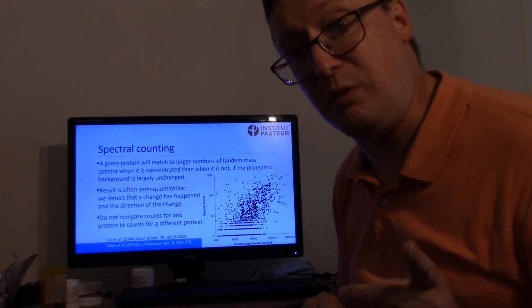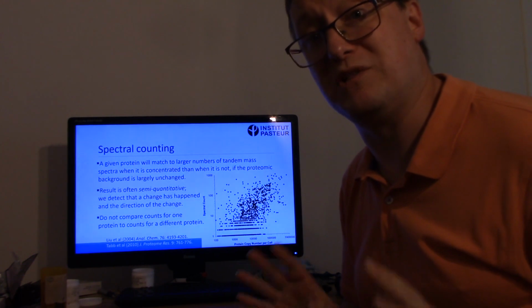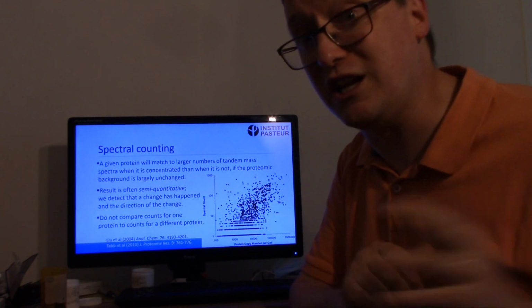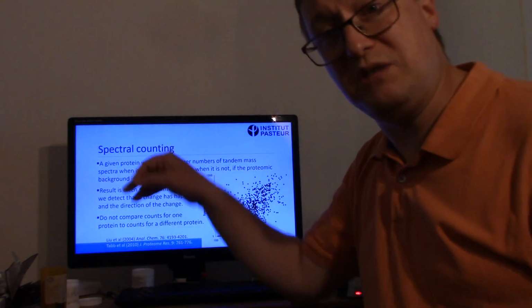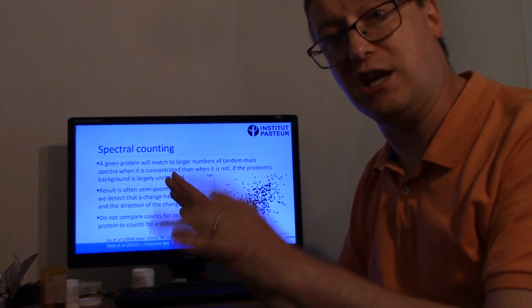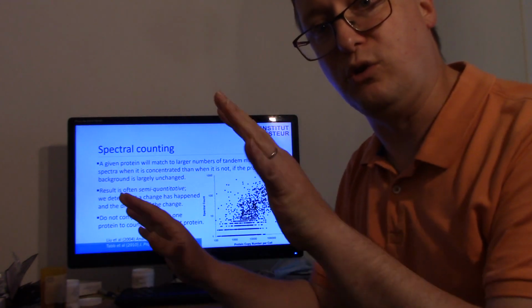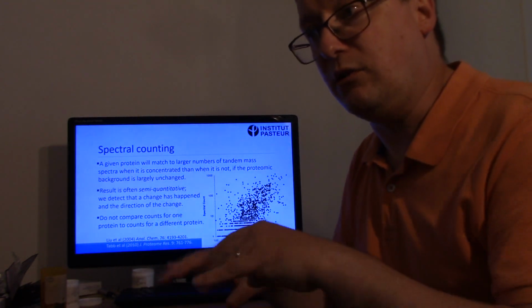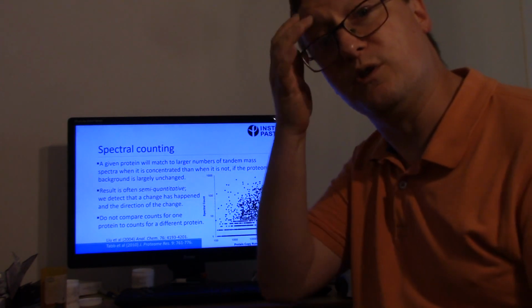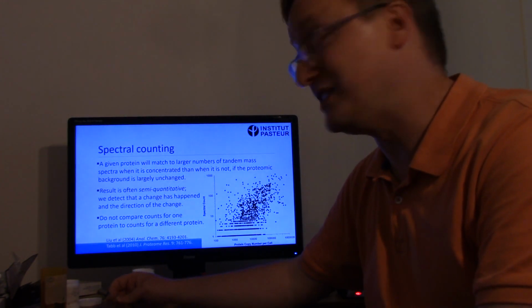Now, I will say this of biofluids, there are a lot of special rules that come into play, so using them as a place for proteomic discovery, biomarker discovery, is fraught with a huge number of issues. I will not be getting into those here. But generally speaking, if the background of proteins remains largely unchanged and a particular subset of proteins is rising and falling between a control and a case cohort, then we would hope to be able to recognize that through spectral counting.